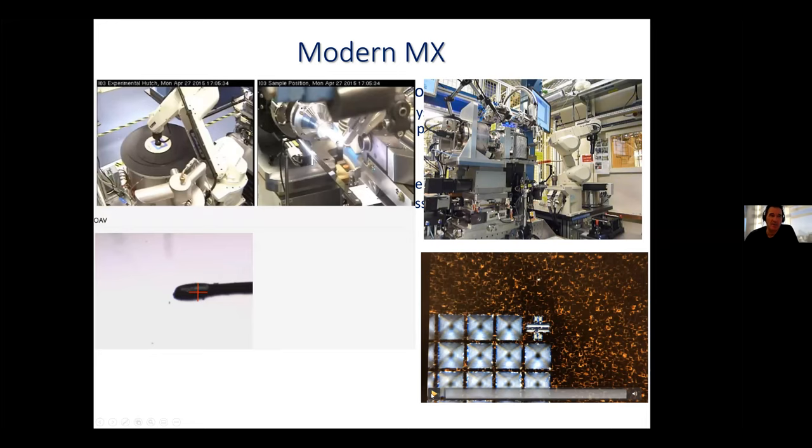So what you'll see in a moment is a scan of these little squares here, which are individual wells that contain a droplet of solution that the crystal or collection of crystals is growing in. Each of them can be centered in the X-ray beam. An X-ray dose can be given, the scattering can be measured, and then it'll move on to the next sample. But it'll do that approaching 100 times a second. So you can measure 100 crystal growth systems a second with this sort of technique.